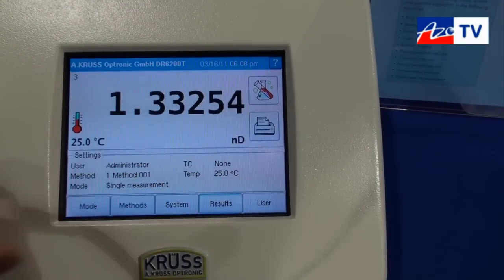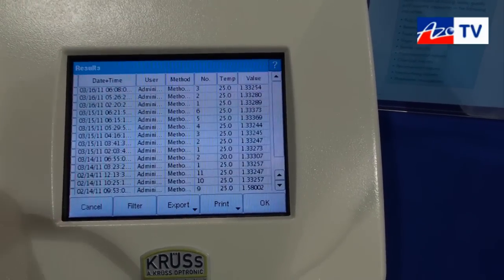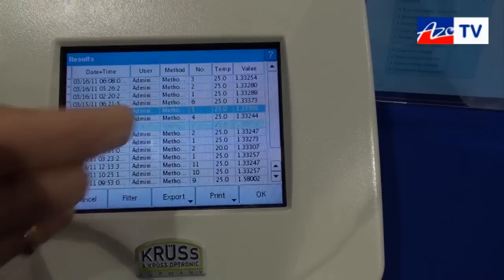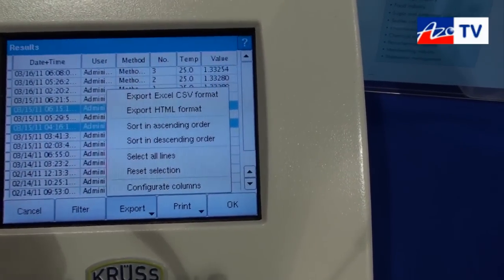We also have storage for the last 999 results. These results you can select and export in an Excel file directly to a USB stick.